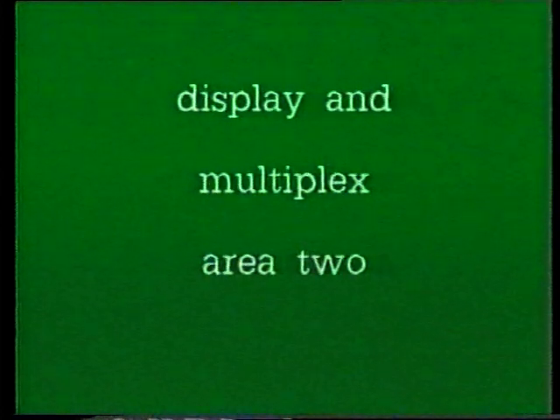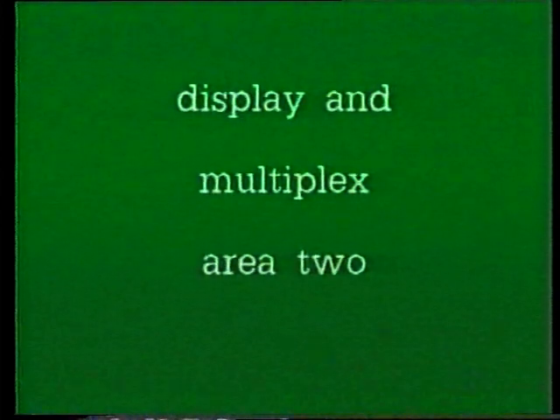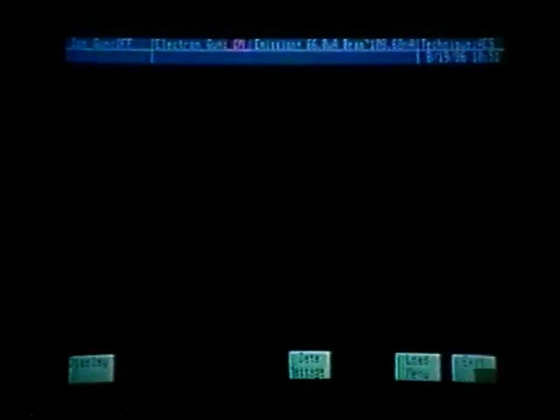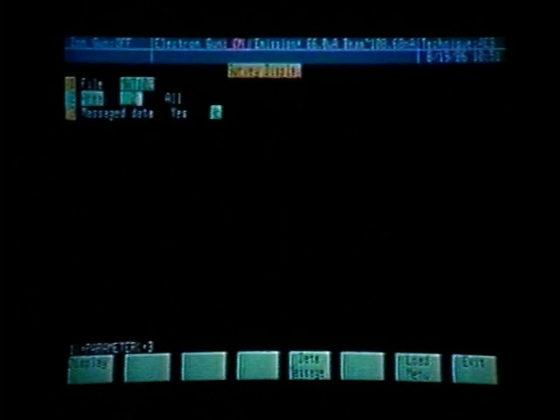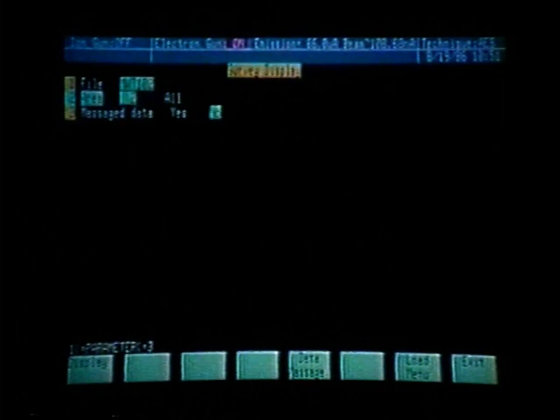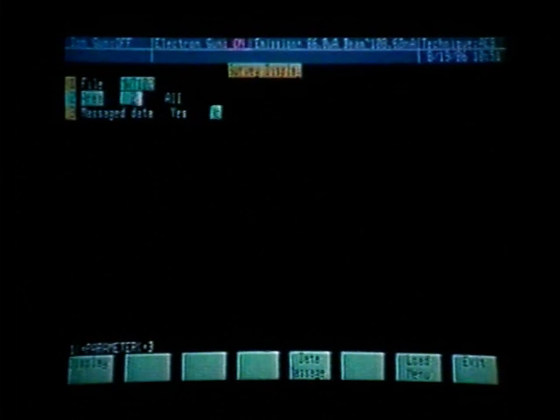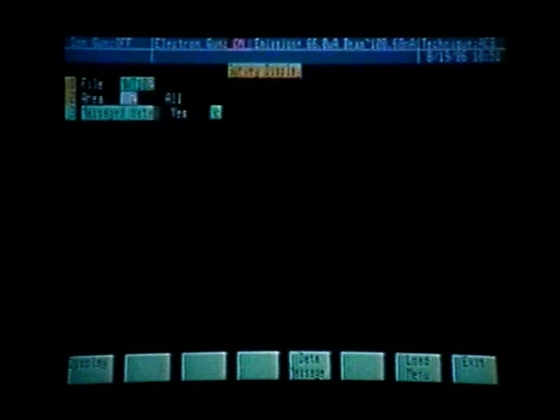To do that, we will hold the shift key and press function key number 15. Let's display area number two, which is the most interesting for multiplexing because it has several elements. Soft key number one allows us to display. We also see that we have already differentiated and smoothed that data, so it has been massaged. Rather than going through the data massage again, we could use function key number three and toggle massage data to yes.